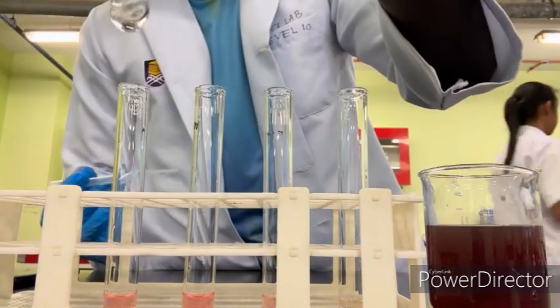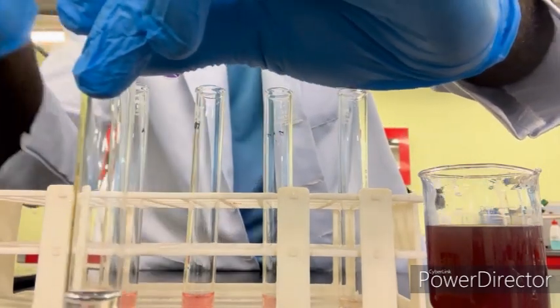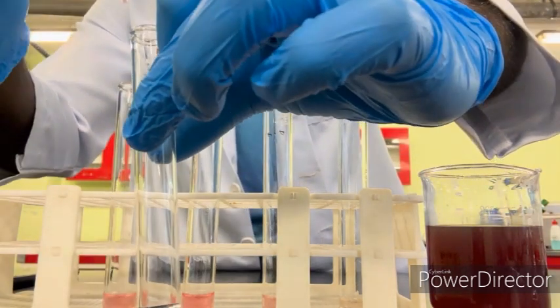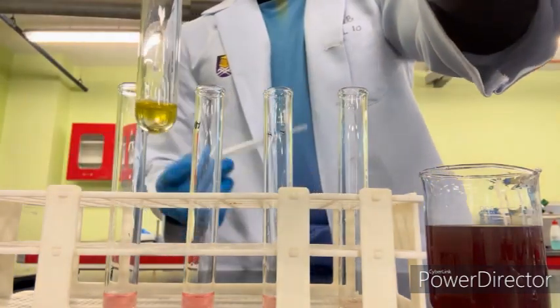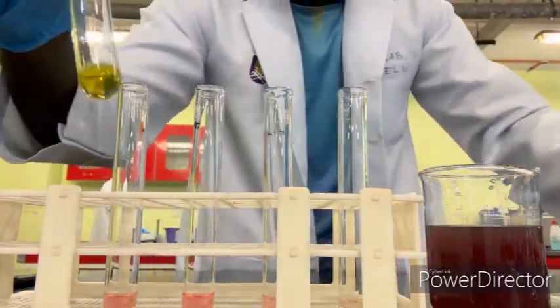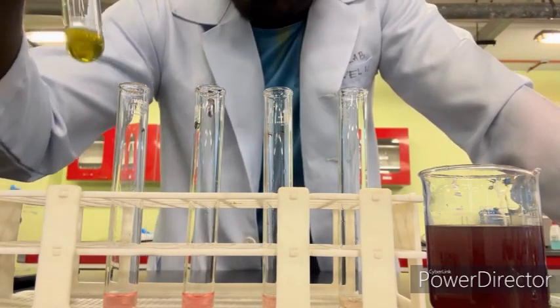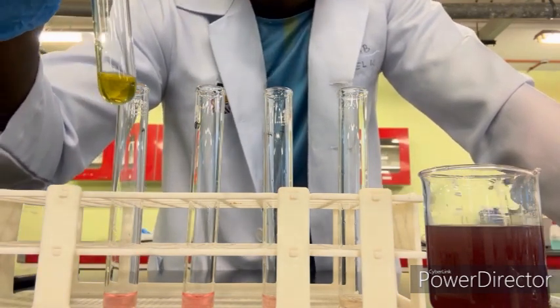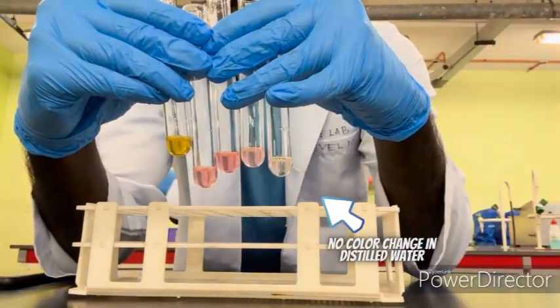And lastly, I'm going to add the solution for the 1m NaOH. I'm going to add a few drops. Okay, so these are the changes for the 1m NaOH. So once we added our solution, you can see there's a yellow color change for this 1m NaOH. So this is the result once we added the solution to our chemicals.